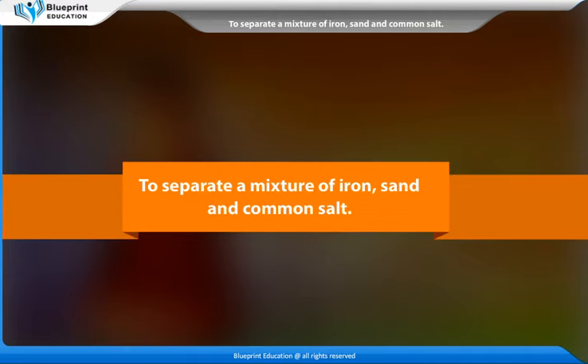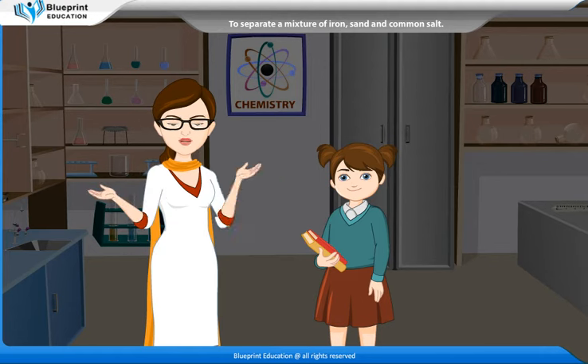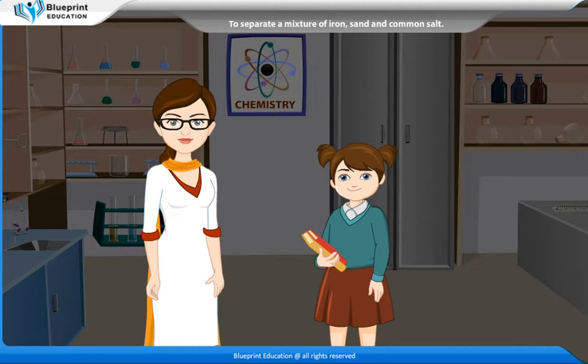To separate a mixture of iron, sand and common salt. A pure substance contains only one element or a compound with no other elements or compounds mixed in it. The impure substances are basically the mixtures of elements or mixtures of compounds or both. But madam, how will you separate the components of a mixture of iron, sand and common salt?